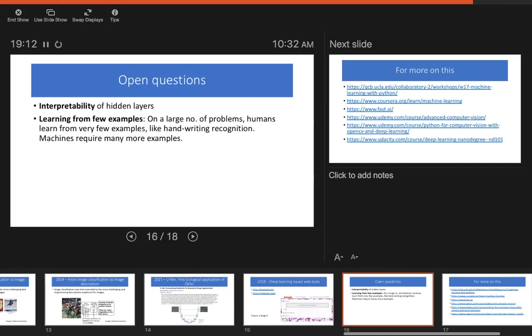In places where we're just taking something that we can do on our own, we're pretty good at image segmentation, and we can understand if something is working or not. Basically it's an automating tool, so it can do it much faster and more efficiently. So this is probably a good use of machine learning at this point for our needs and for science in general.